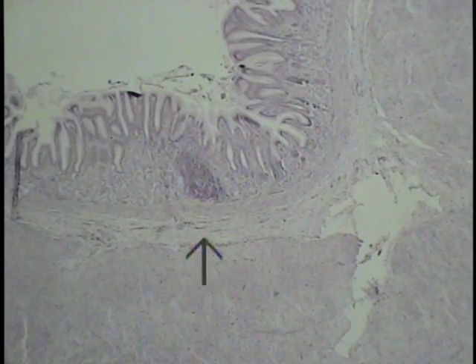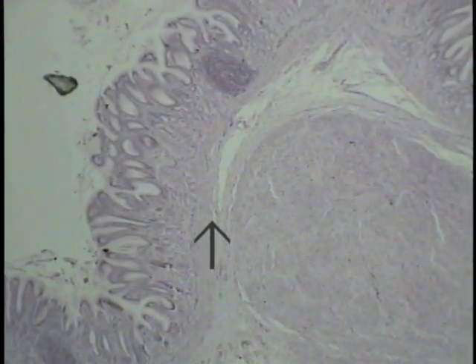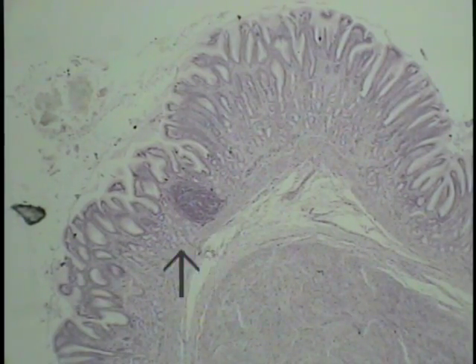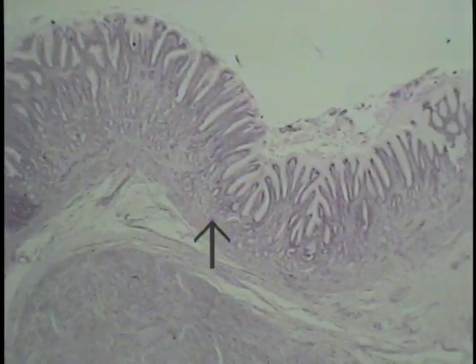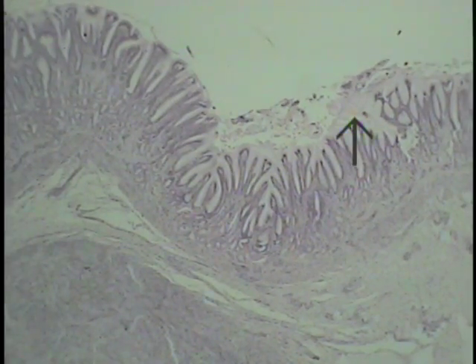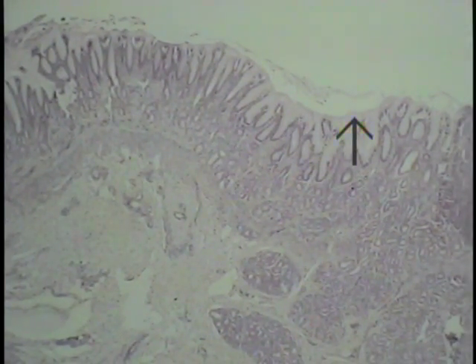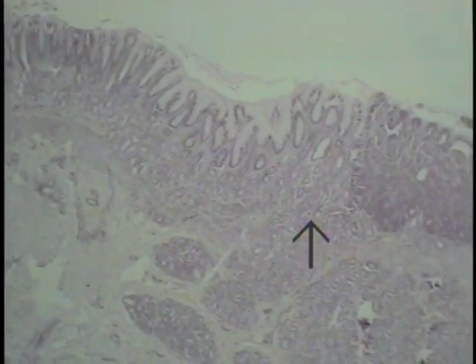Now, if one courses distally towards the intestine and follows the mucosa, and we're keeping our arrow on the muscularis mucosae, one can see a lymphatic nodule coming into the field of view. And this scalloped appearance is fairly typical of the rugae cut in section of the stomach. It's sort of a folded nature to it. And all of a sudden, as we're tracing this muscularis mucosae in this direction, we see a dramatic change occur.